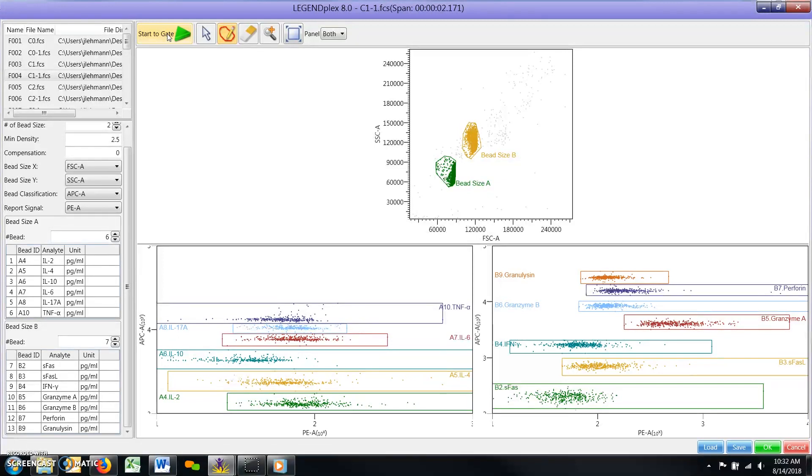Note, you can still use the manual gating tools after the auto-gating function draws your initial global gates should you wish to make any adjustments.